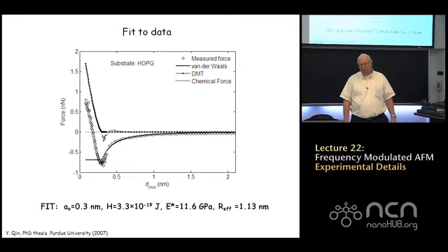That's also why you have such a high K or stiffness, is because you can make the amplitude very small as well, correct? What's coming out of the recent literature is that as you shrink the amplitude of the oscillation of the cantilever, of the tip, as you make the amplitude of the tip oscillation smaller and smaller, it becomes a little bit easier to achieve atomic resolution.